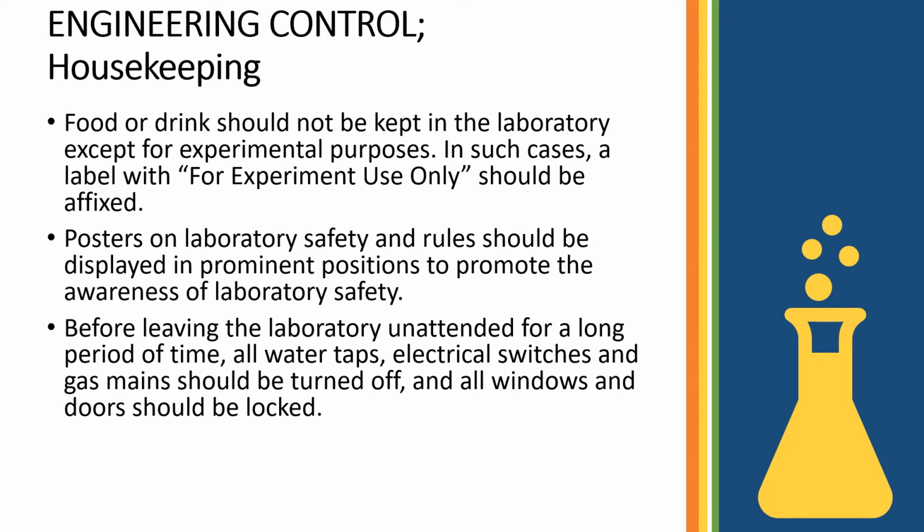Food or drink should not be kept in the laboratory except for experiment purposes. In such cases, a label with "for experiment use only" should be affixed. Posters on laboratory safety and rules should be displayed in prominent positions to promote the awareness of laboratory safety. Before leaving the laboratory unattended for a long period of time, all water taps, electrical switches, and gas mains should be turned off, and all windows and doors should be locked.